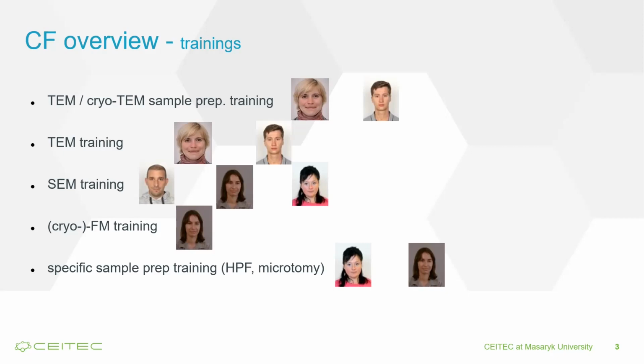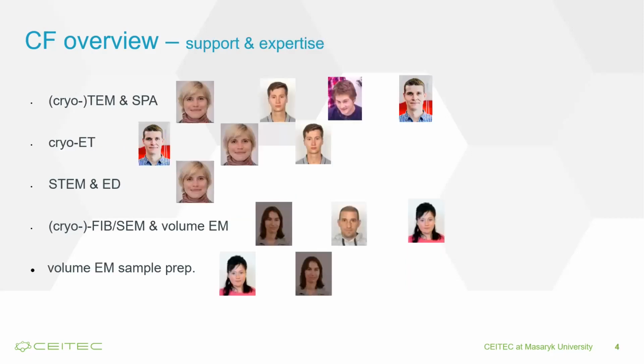Of course, it's not only the imaging; good sample preparation is of the most importance for successful imaging afterwards. In that case, Radka and Jana will be the main people you will meet. So with this, I would like to invite you, if you want something, to feel free to contact my colleagues directly. Or if you don't know whom to contact, just come to me and I will refer you to the correct person.